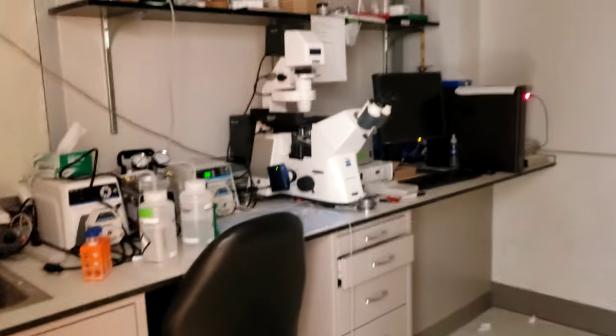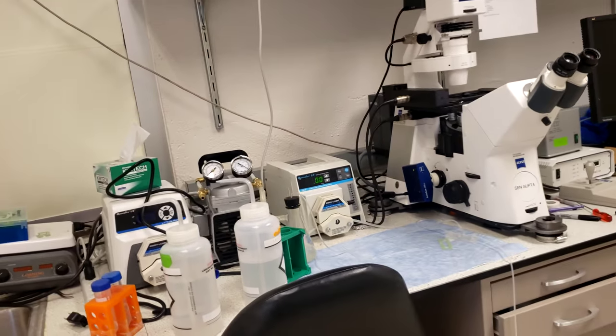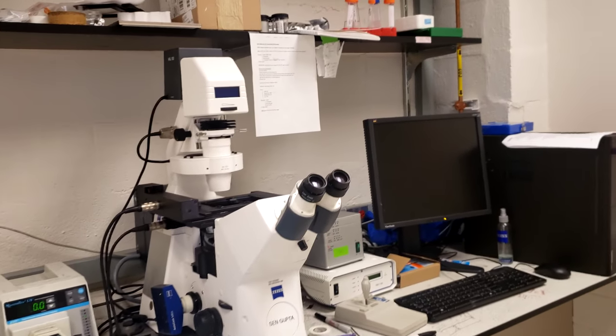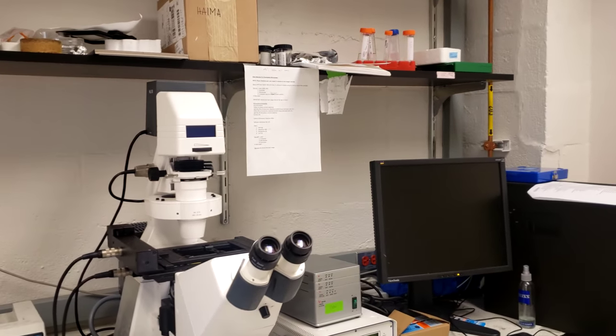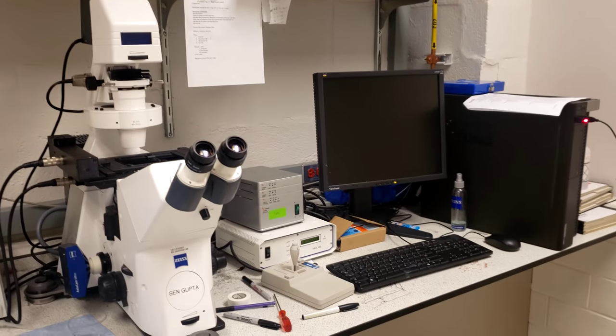And finally, we have a microscope room where we run flow experiments to measure our particles under dynamic conditions, and then we can also image our particles on the microscope we have over here.